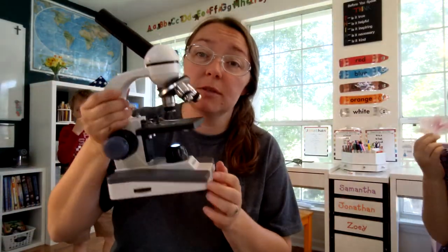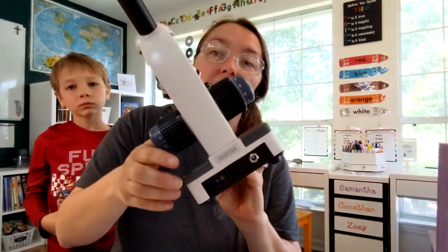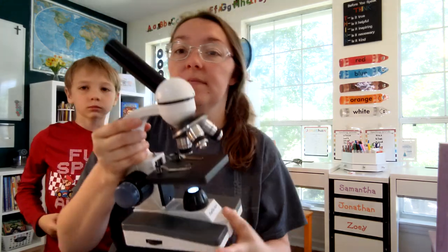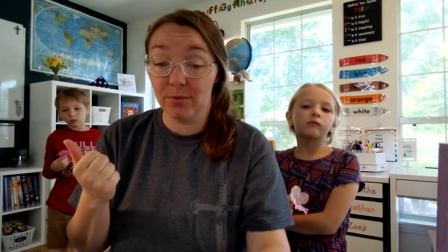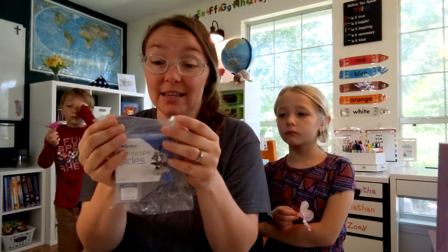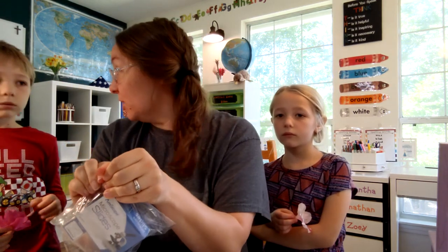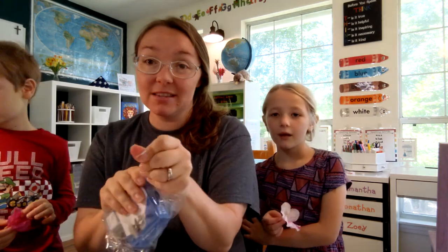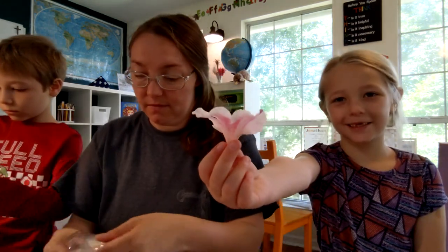All right, so all I did was put in the batteries on the bottom and switch it on on the back right here, and then the light came on. So we are going to prepare our slides with the flowers that we picked outside. I'll open up our blank slides here and we will become botanists — what do you guys think? You guys want to be botanists? Yeah? Okay, let's go!